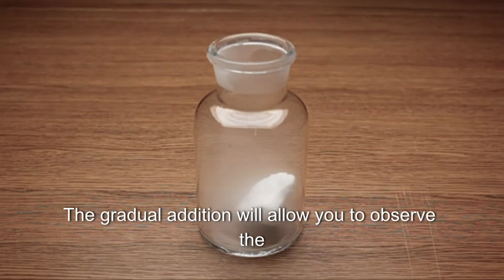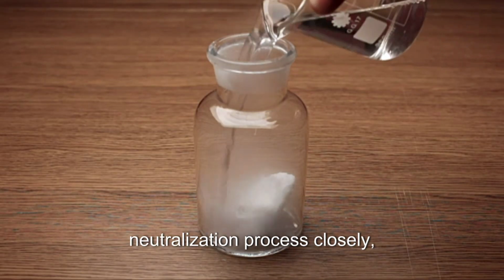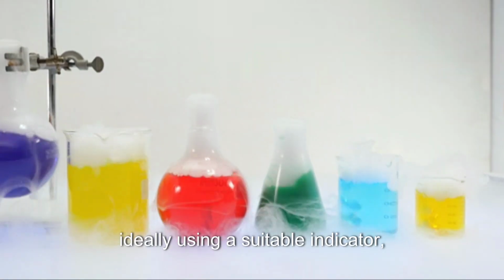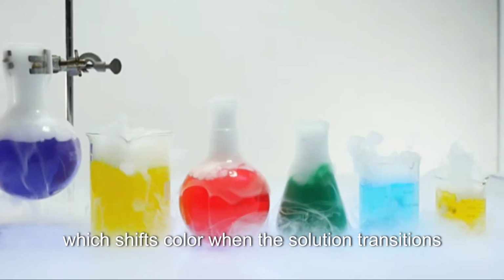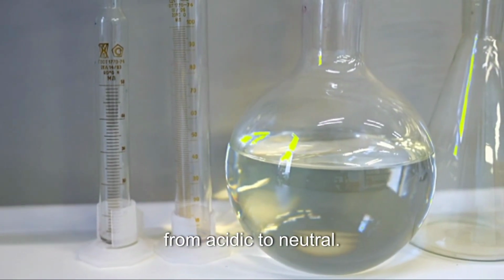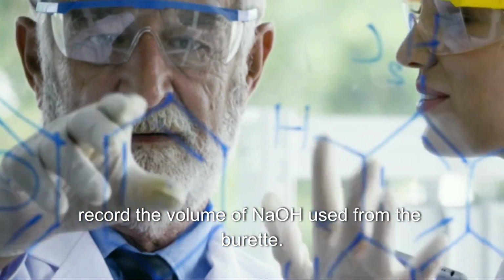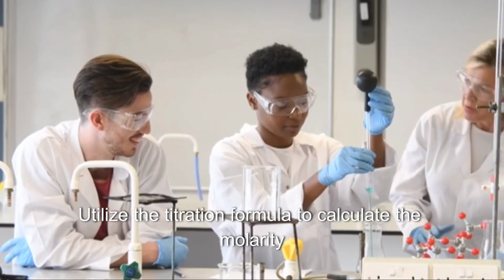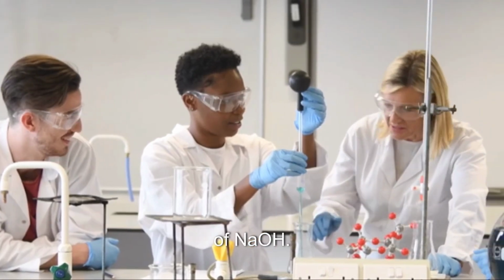The gradual addition will allow you to observe the neutralization process closely, ideally using a suitable indicator such as phenolphthalein, which shifts color when the solution transitions from acidic to neutral. Once the endpoint is reached, record the volume of NaOH used from the burette. Utilize the titration formula to calculate the molarity of NaOH.